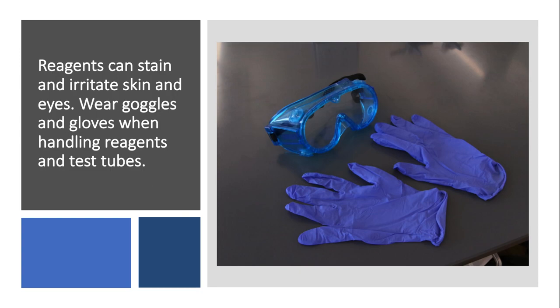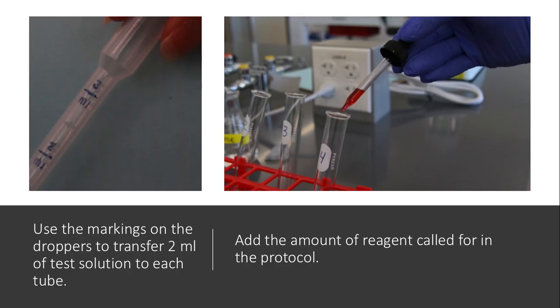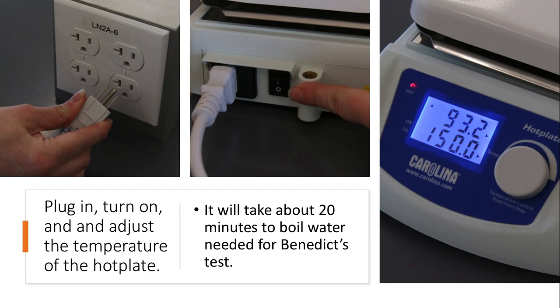So these are tips for whenever you're actually in lab. Remember that whenever you're handling these things, you want to use gloves and goggles. Fortunately, this week you don't have to do any of that, but keep that in mind for the future. These details might want to be known for the background information that you'll be writing in your summary. So we are going to be transferring 2 milliliters of the test solution into each tube, and you'll add the amount of reagent that the protocol asks for. We'll be plugging in a hot plate for the Benedict's test because the water needs to be boiling in order for that one to show up.